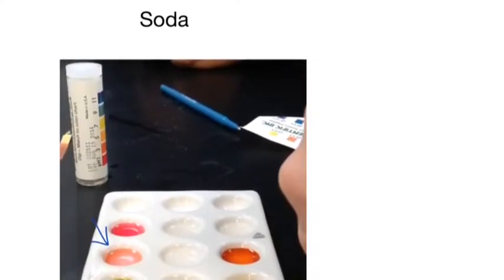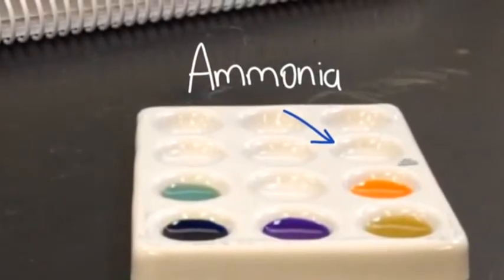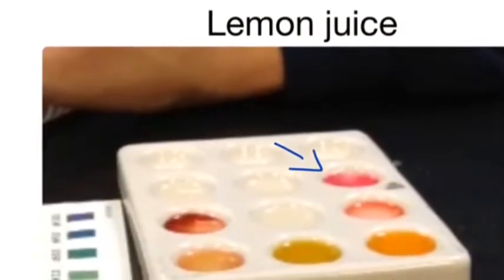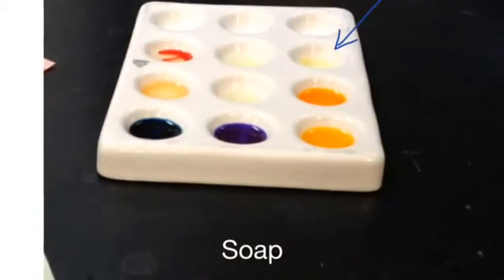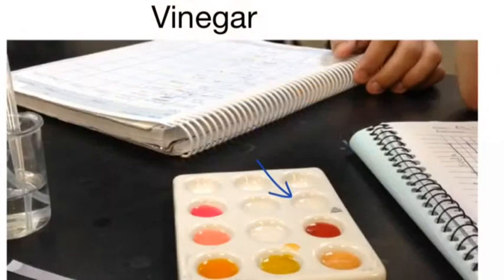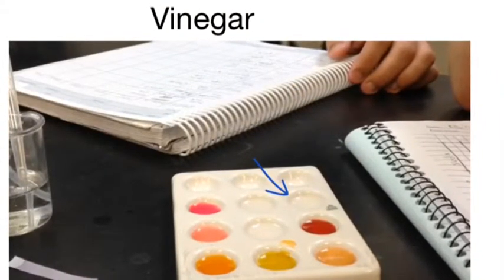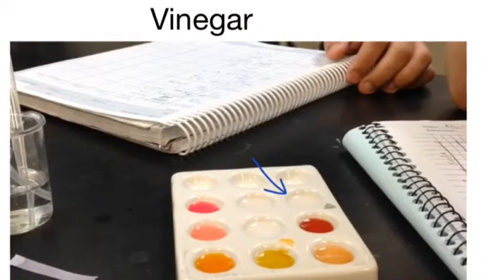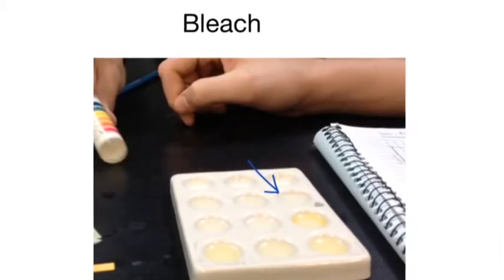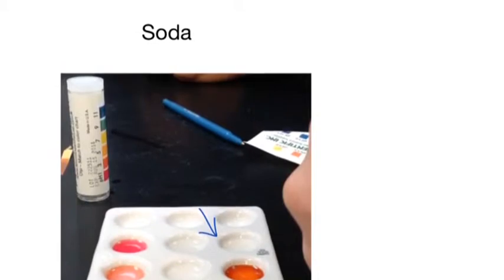When we put the pH paper into the ammonia, the pH paper turned light green, showing that it was a base. When we put the pH paper into lemon juice, it turned dark red, showing that it was an acid. When we put the pH paper into soap, it turned yellow, showing that it was an acid. When we put the pH paper into vinegar, it turned orange with no change, showing it was an acid. When we put the pH paper into bleach, it turned light green, showing that it was a base. And finally, when we put the pH paper into the soda, no change, and it was an acid.